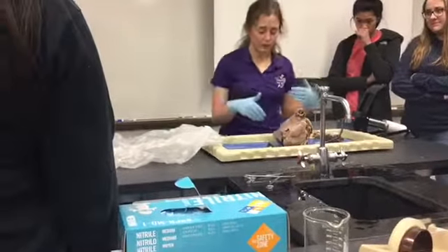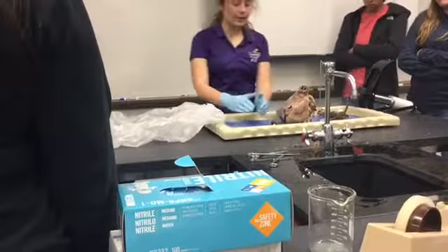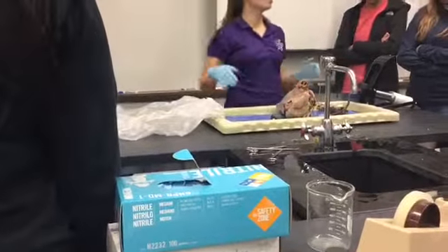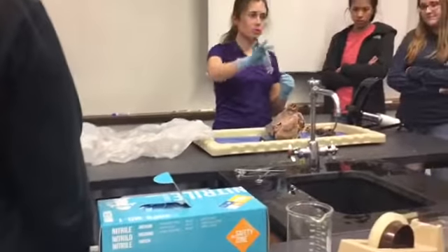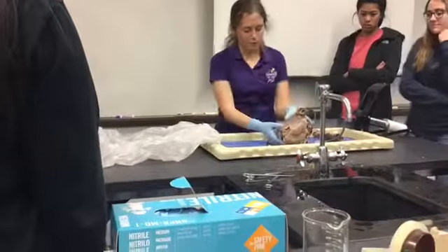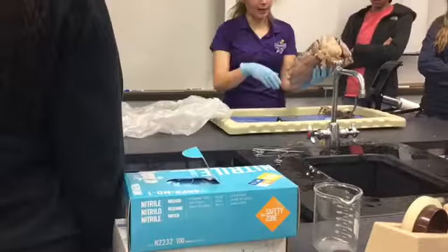So you're not going to be able to look at this and figure out where the head would be. Instead, you're just going to have a lung and a lung. You're going to have to identify them based on the number of lobes. So remember, right lobe, three, left lobe, two. The heart is underneath here. We'll get to the heart in a minute.